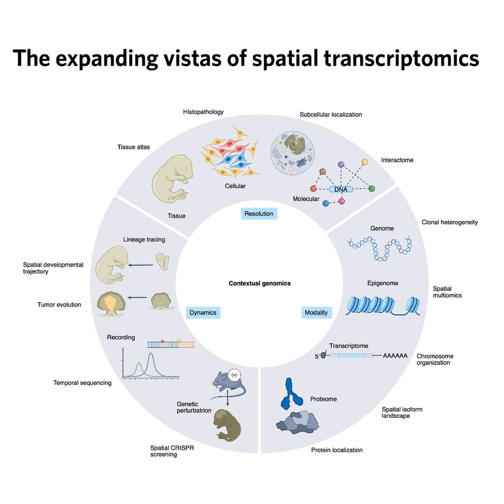But surely this massive detection effort, trying to image potentially millions of molecules over many rounds, must run into some physical limitations. Oh, it absolutely does. The primary bottleneck, especially as you push for higher and higher numbers of genes or just denser tissues, is often referred to as the crowding problem. Too many spots too close together. Exactly. As you try to image more and more individual RNA molecules within a packed cell or tissue, the fluorescent spots start to overlap. They get too close together, which makes it really hard for the imaging system and the algorithms to accurately distinguish them and decode their combinatorial codes.